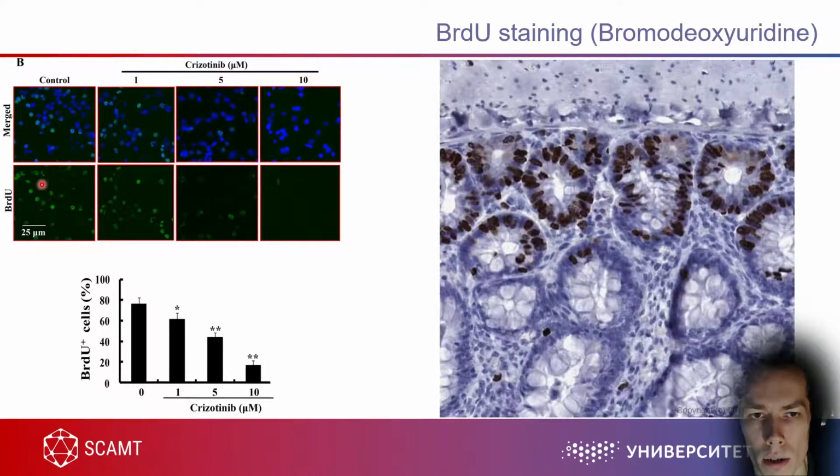and in control samples you see some of the cells dividing, so showing in green. But at high concentration of anti-cancer drug, well, definitely cancer cells will die. The cells will not divide, and as you can see, there are no cells in mitosis. So the drug is working, the staining is working too. And this is just an example of counting of the cells, maybe on a fluorescent microscope.